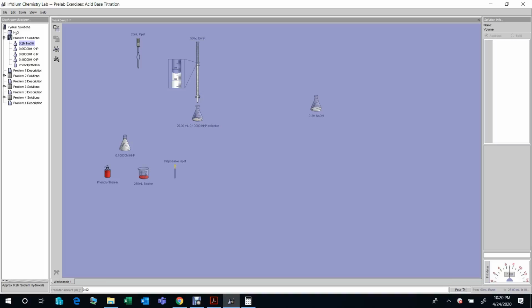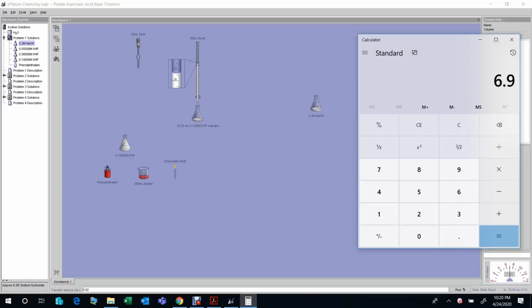And we can record the ending volume, which is 19.4. Then we can tell the difference. The starting is 6.9. The ending is 19.4. Okay, and then 19.4 minus 6.9 is exactly 12.5 milliliter. Exact 12.5. If you're not sure, then we can add another 0.02.